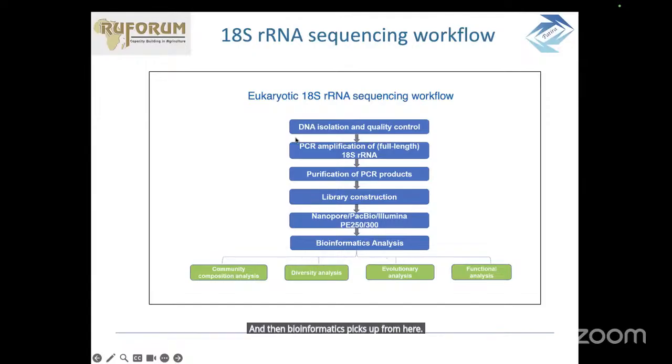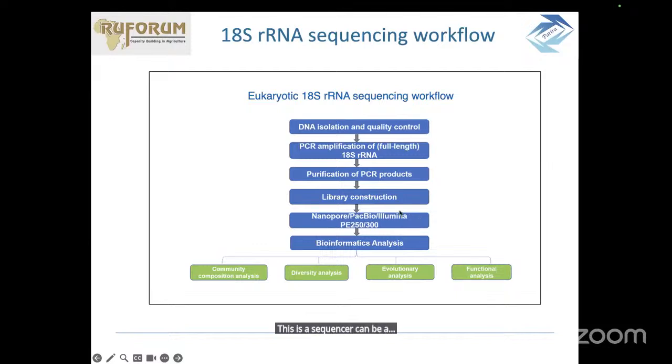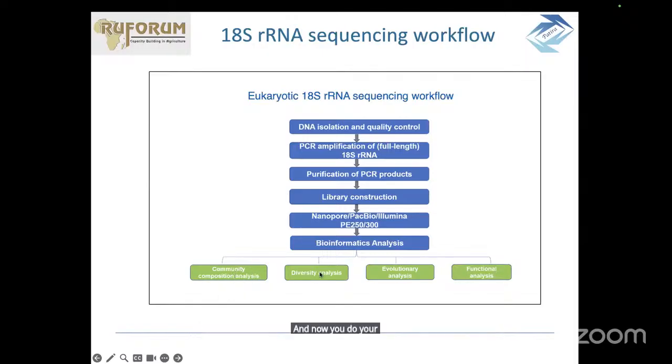So all this part is lab. This is the sequencer, which can be any company, and bioinformatics will pick up from here. And now you do your composition, community analysis, diversity analysis, evolutionary and functional analysis.